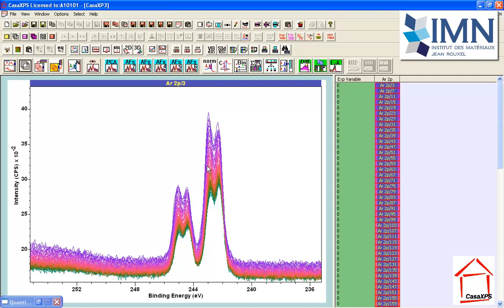It's not really an average, it's a different type of average spectrum, and that will give us an indication if there are actually genuinely 1, 2, 3 or however many changes that are occurring within the data that can be recognized through the principal component analysis calculation.